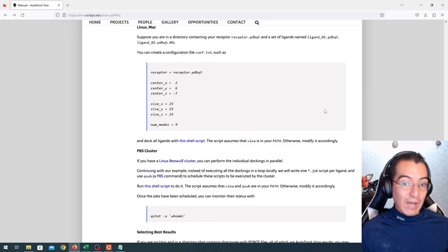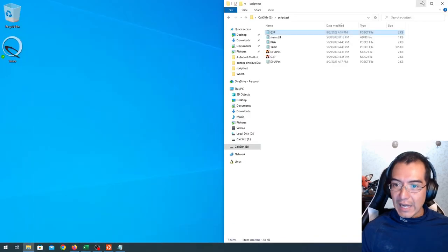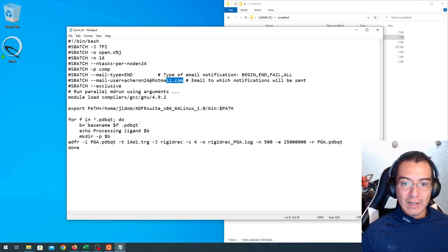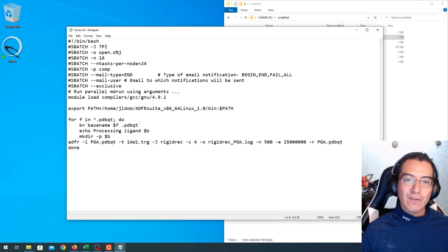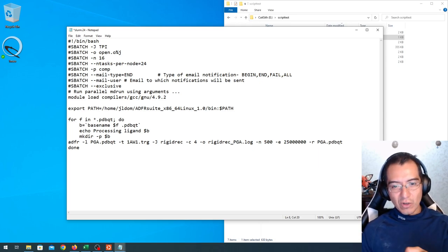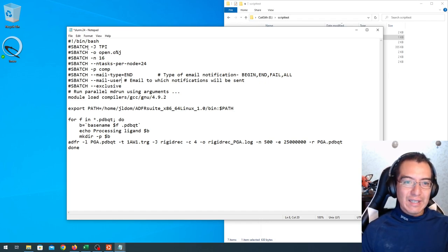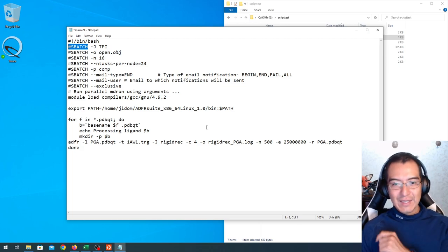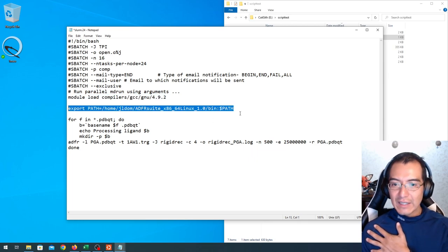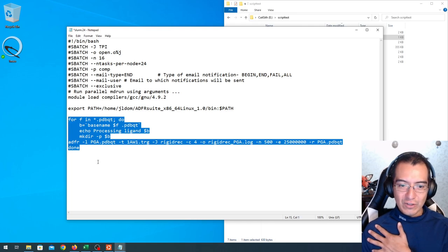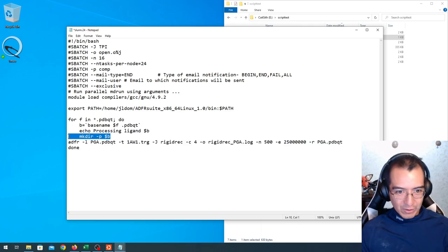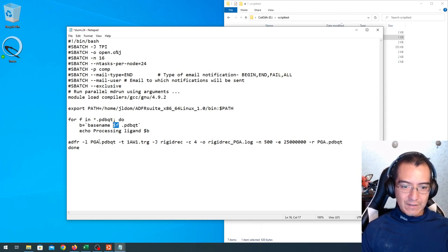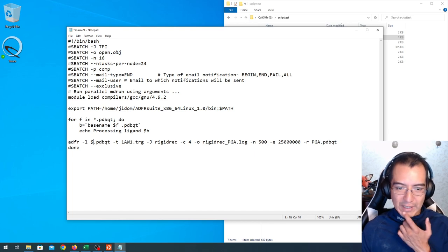It's going to be reading the list of pdbqt ligands and performing the docking. I've been adapting this for years to run on any Unix machine. Here's an example from a cluster running SLURM where I call the compilers for ADFR and then in a similar fashion to the script, run the docking.